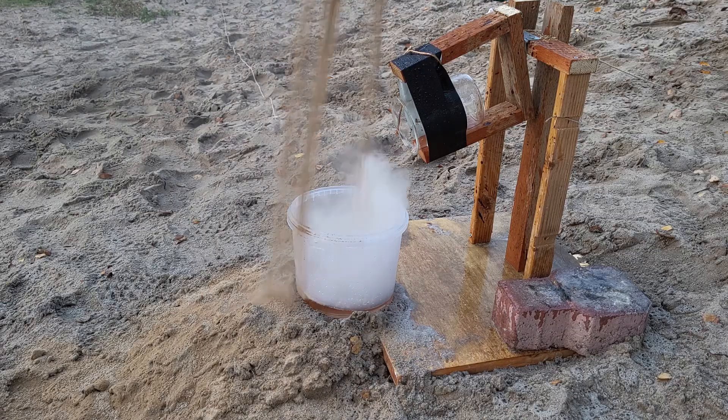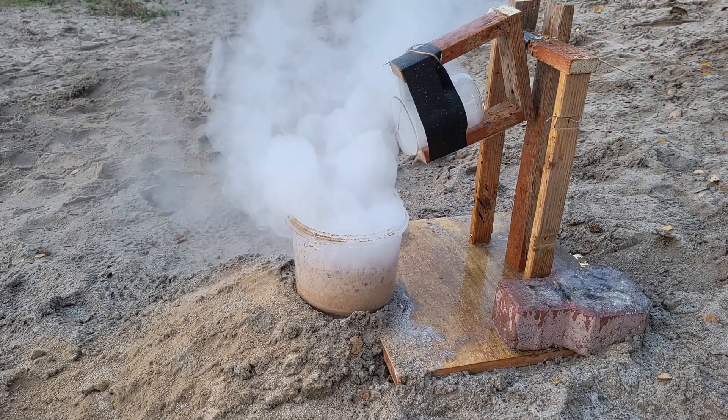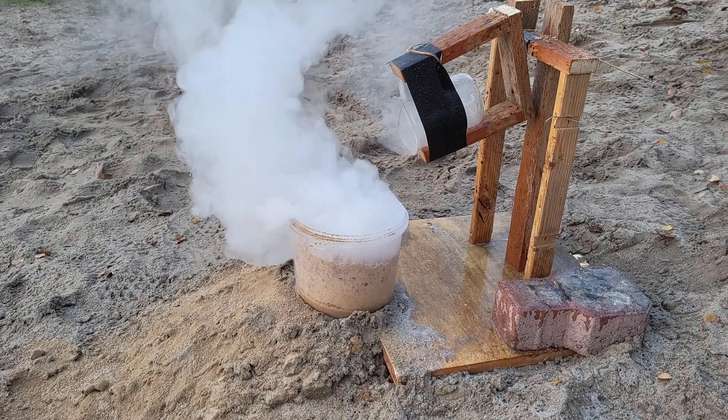Now after pouring in quite a lot of lime to the remaining acid, I added some water to dilute it down, not expecting anything — but surprisingly it exploded on me, completely ripping apart the plastic bucket it was in.